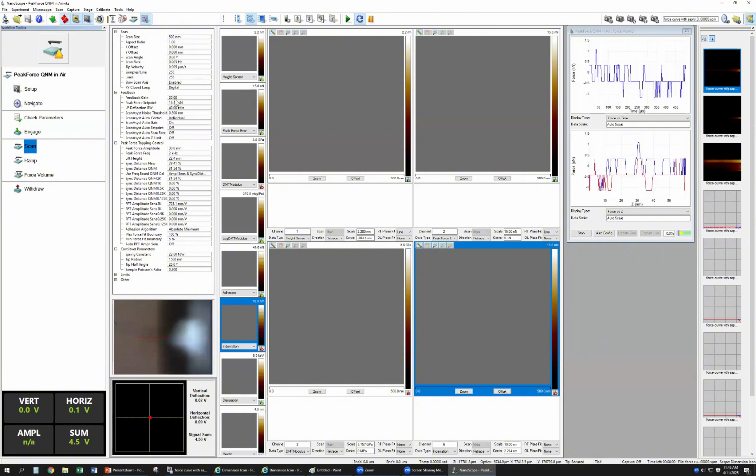Your force is 70, now it is over this set point. You should reduce. We use the controller inside, the PID feedback, to control that: come back or increase the distance.